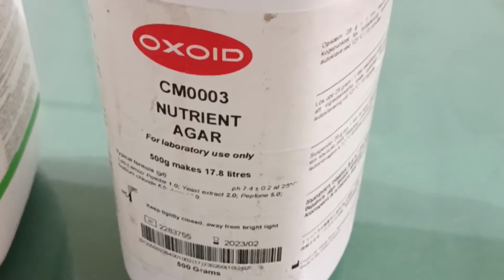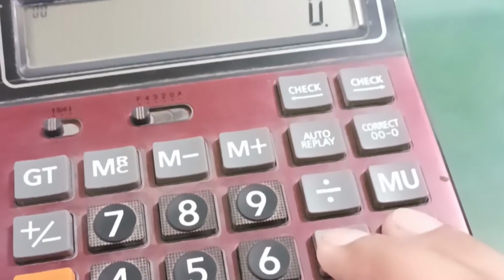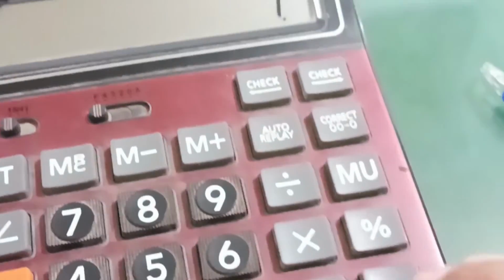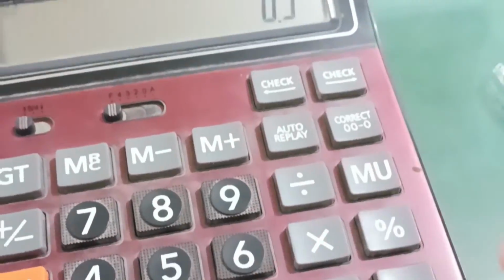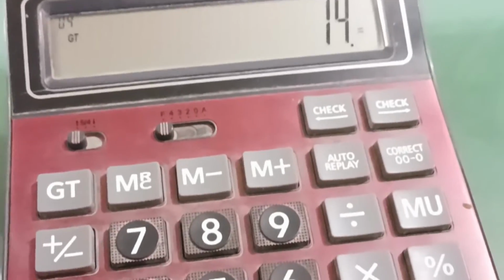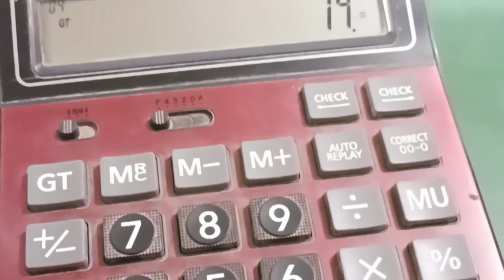Now I am going to prepare nutrient agar, and as per the description, 28 grams of nutrient agar should be dissolved in 1 liter of distilled water. I am going to prepare half a liter of media. So we can calculate that 28 grams of media can be dissolved in 1 liter, and for half a liter we will need 14 grams of nutrient agar media. So we will take 14 grams of nutrient agar media and 500 ml of distilled water.